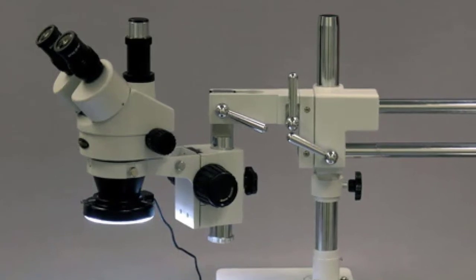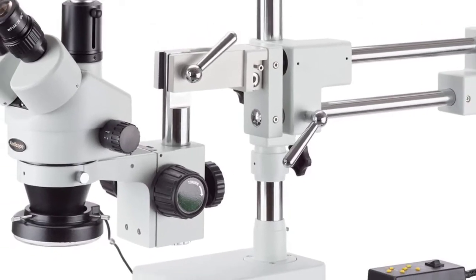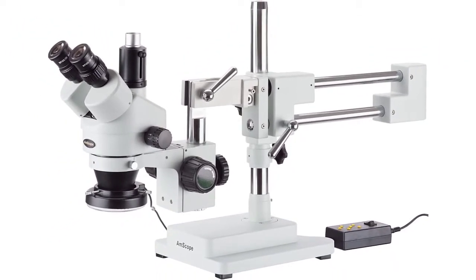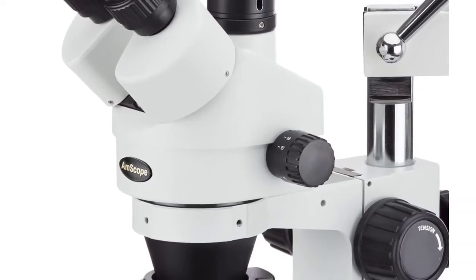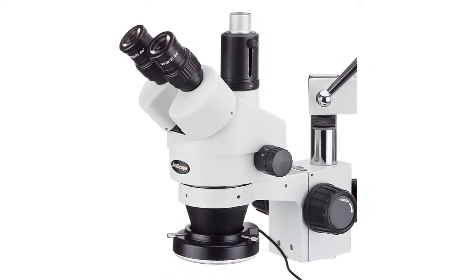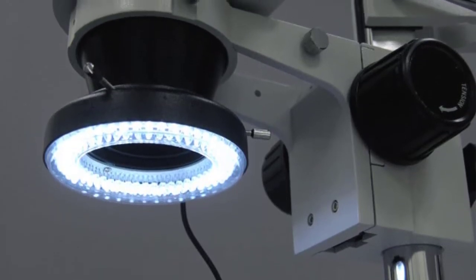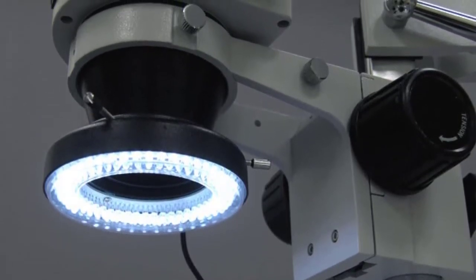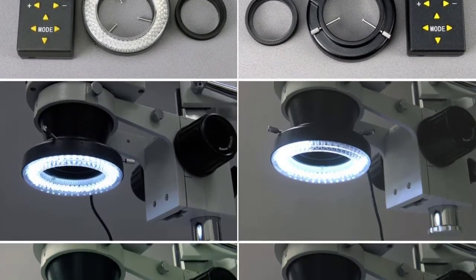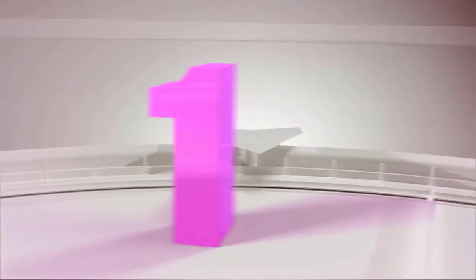Professional stereo microscope with boom stand has long working distance to enable users to perform work or manipulate large items including circuit boards and dental appliances. Trinocular viewing head with 10x super wide field eyepieces, adjustable interpapillary distance, fixed 45 degree inclination, and 360 degree rotation. The 0.7x-4.5x zoom objective provides continuous zoom magnification. A 0.5x Barlow lens extends working distance and a 2.0x Barlow lens extends magnification range.